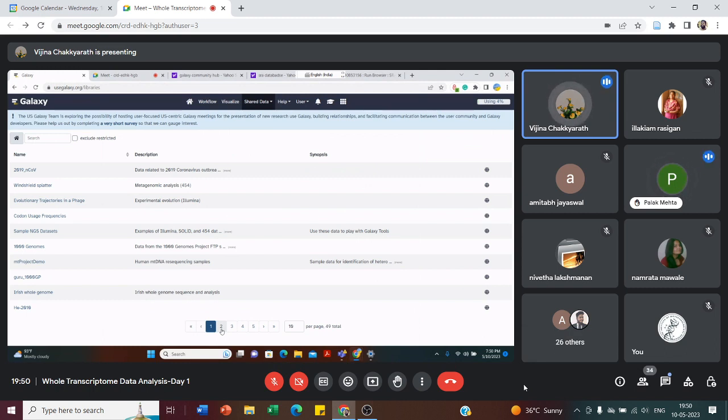Then I'll show how to do it, or I think you can chat in private. Okay, sure, ma'am. Thank you. I have another question: are the tutorials on Trinity reliable? Like, can I follow the tutorial and get the results?